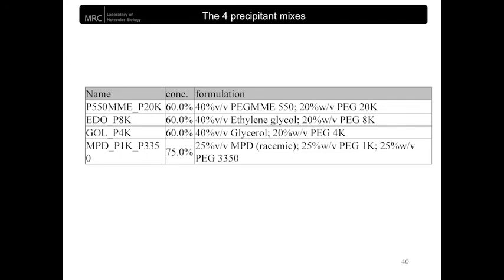The cryo used in MORPHEUS 1 were already well known from crystallographers. Less known reagents were employed in MORPHEUS 2 and will be presented later. As for the stocks of additive mixes, the concentration of a stock is a sum of concentrations. However, the concentration of precipitants in the stock is now 2 times the final concentration in the screen.